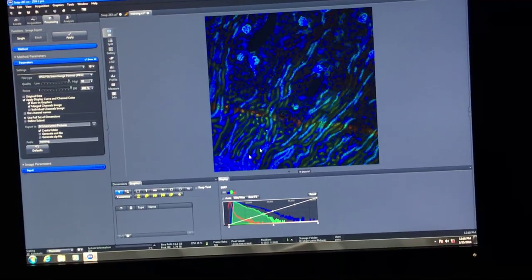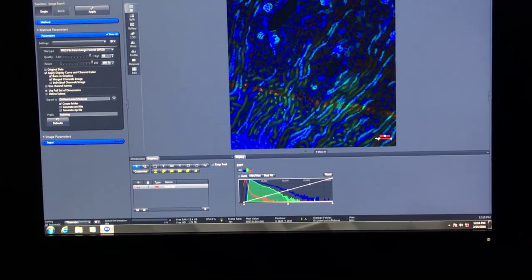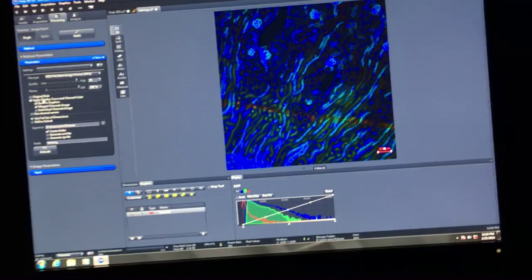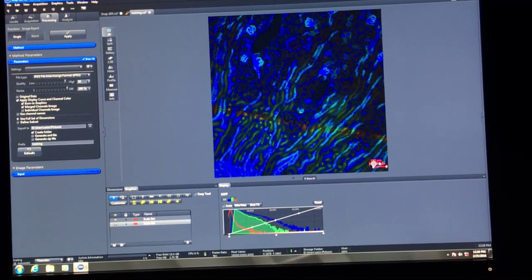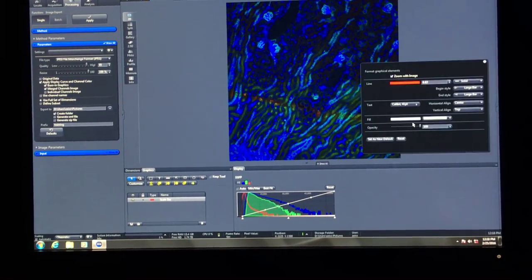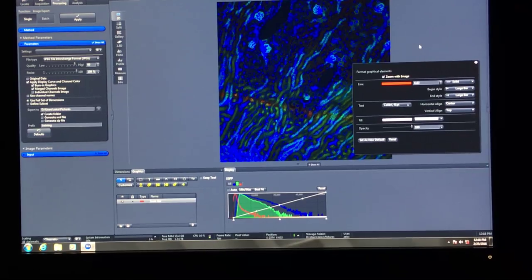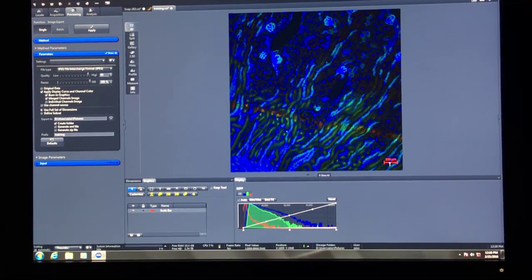You can also add a scale bar using the ruler graphic in the graphics section. If you don't like how it looks—red font, too small, borders around it—right-click and select 'format graphical elements' to change line color, font size, and text size. If 'burn graphics' is checked, that scale bar will be exported with the image.